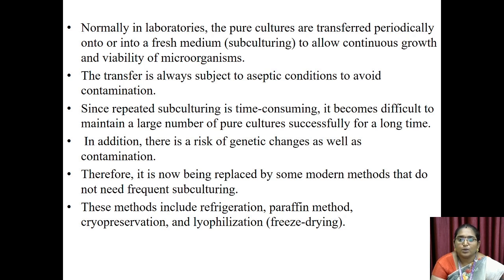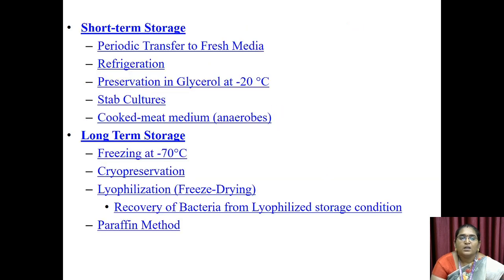These methods include refrigeration, the paraffin method, cryopreservation and lyophilization, otherwise called freeze drying. They fall into two types, short-term storage and long-term storage.